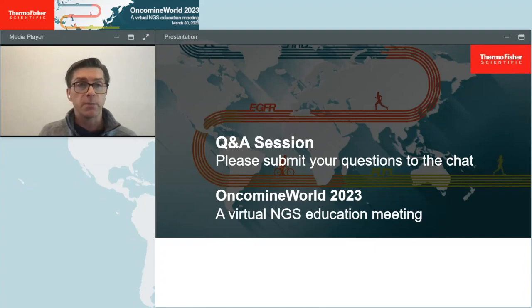Now, if you're not doing library prep on the instrument and are starting from already pre-made library, you can sequence more samples in a library to sequence run, and then you're simply limited by the amount of throughput that you can get based on however many lanes of the GX5 chip you're running.